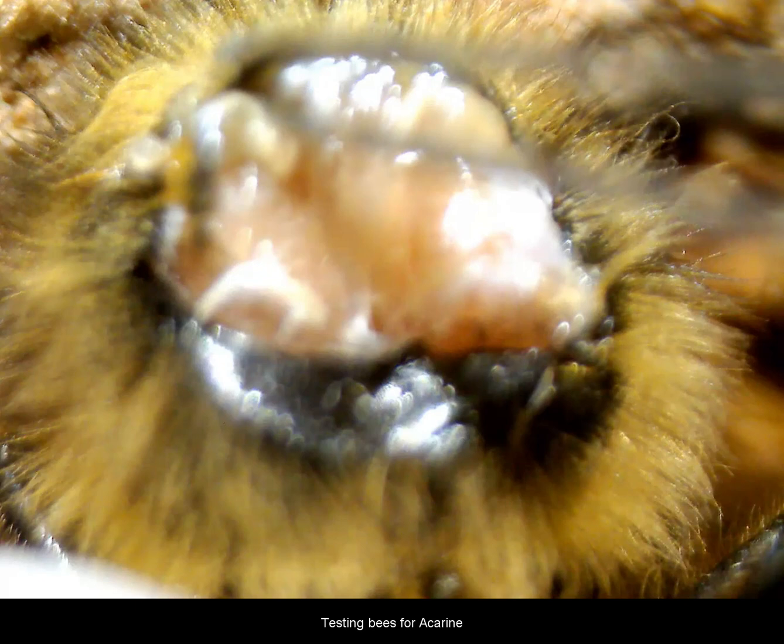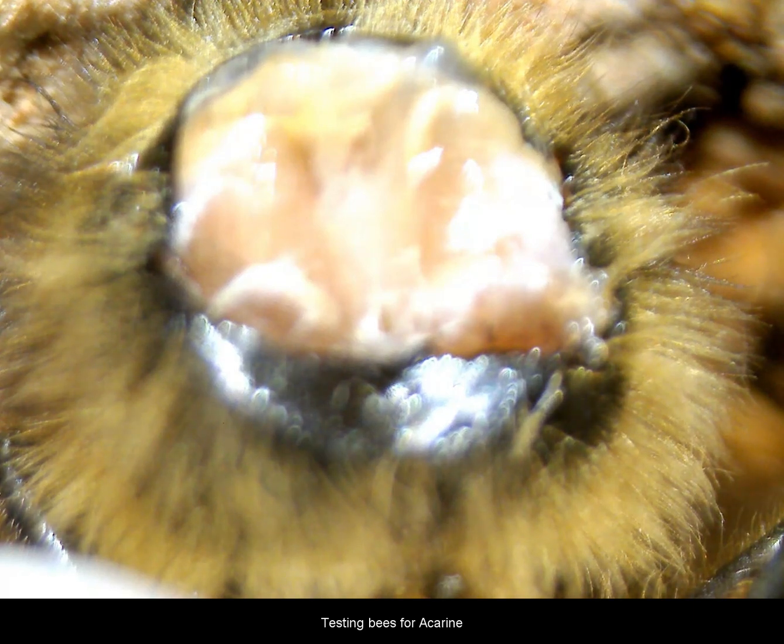We'll have another cut there now to lift that collar out of the way and hope we don't do any more damage. There's a bit of material coming away there with the collar.